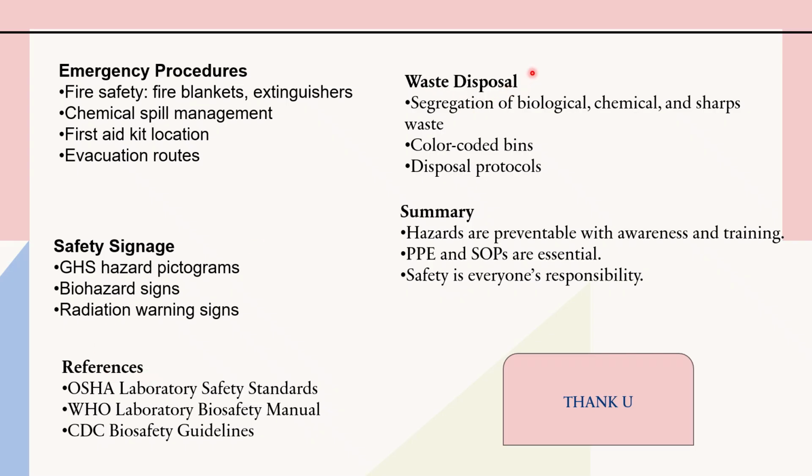Then waste disposal: segregation of biological, chemical, and sharp waste. Then color-coded bins should be used for different kinds of waste disposal. Then the disposal protocol should be followed.